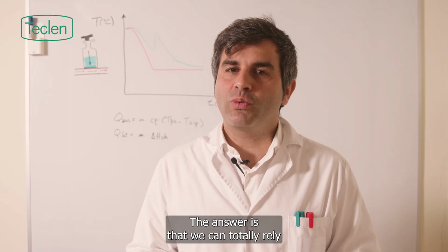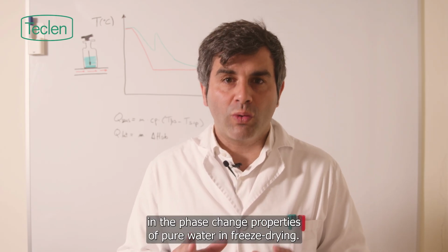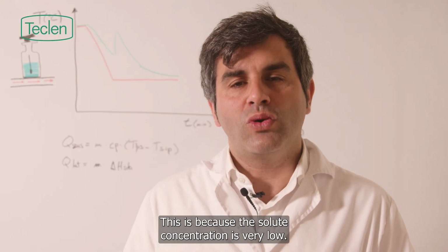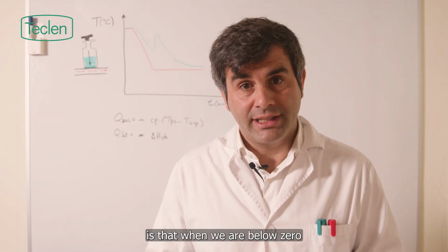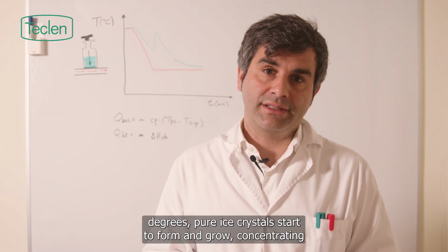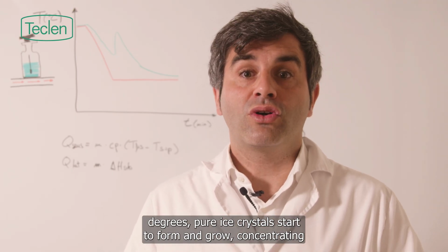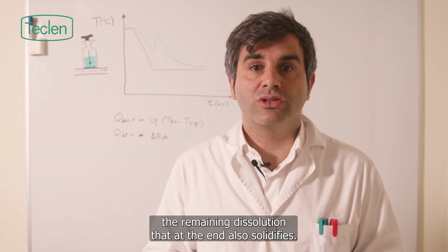The answer is that we can totally rely on the phase change properties of pure water in freeze drying. This is because the solute concentration is very low. And then what happens is that when we are below 0 degrees, pure ice crystals start to form and grow, concentrating the remaining dissolution that at the end also solidifies.